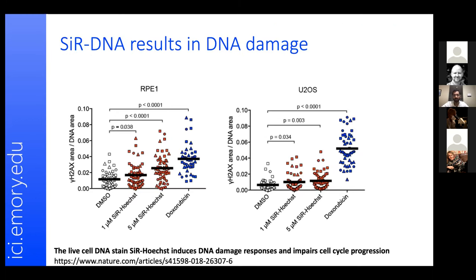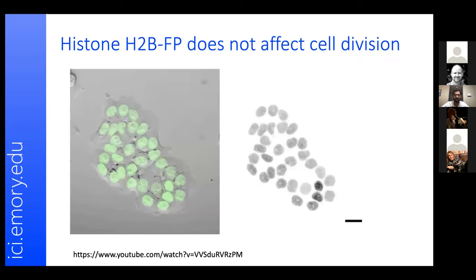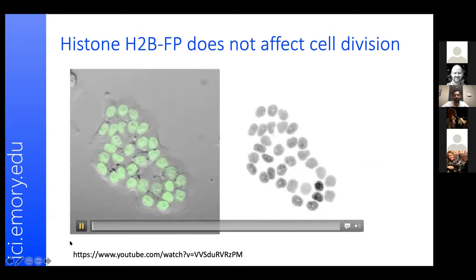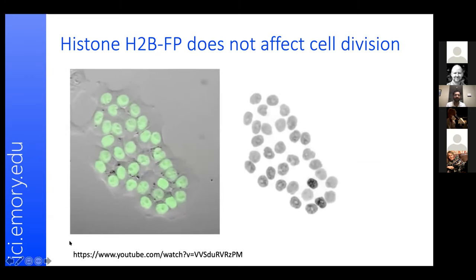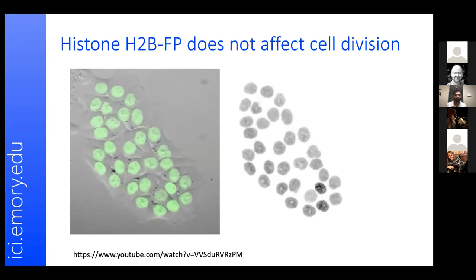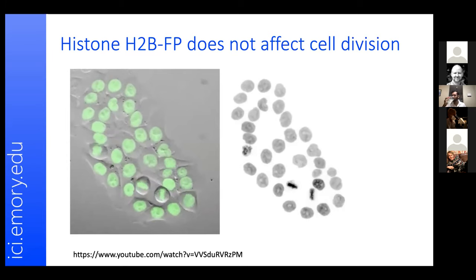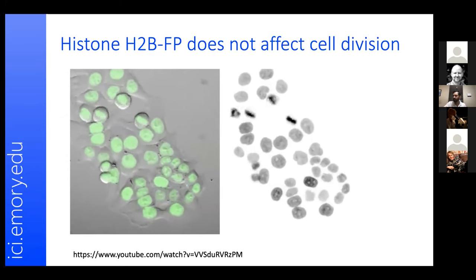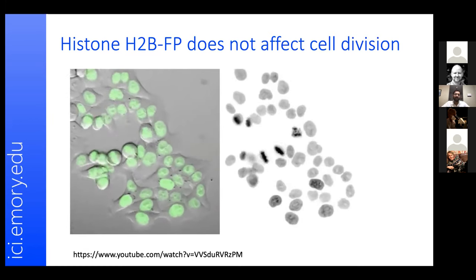Not only does Hoechst or any analog prevent cell division, it also reduces the number of cells entering mitosis. Furthermore, intercalation of these dyes into the nucleus results in DNA damage, which can be quantified by γH2AX foci — a marker of DNA damage. One must be very careful when using these dyes. In contrast, cells expressing histone H2B-GFP are perfectly happy and dividing normally, as seen in live-cell movies.